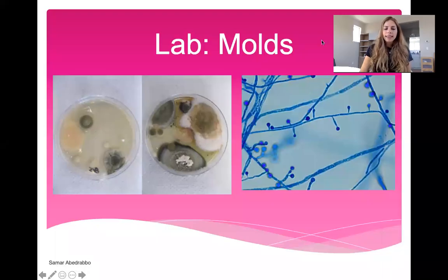Hi everyone. In this lab, we're going to talk about molds. Everyone has seen molds on various surfaces, foods such as bread. And here is mold grown on a certain type of agar plate. This is obviously not microscopic because we can see it with our naked eye, but molds do have a microscopic portion of their life that we will talk about.